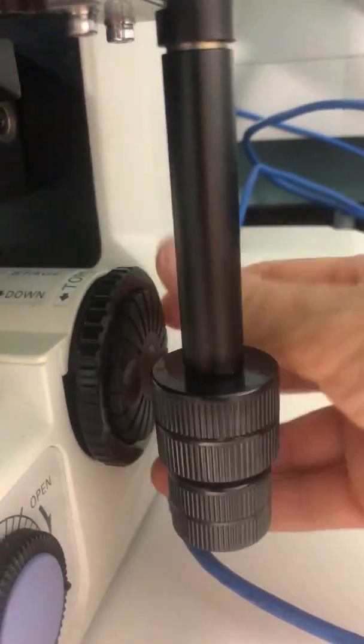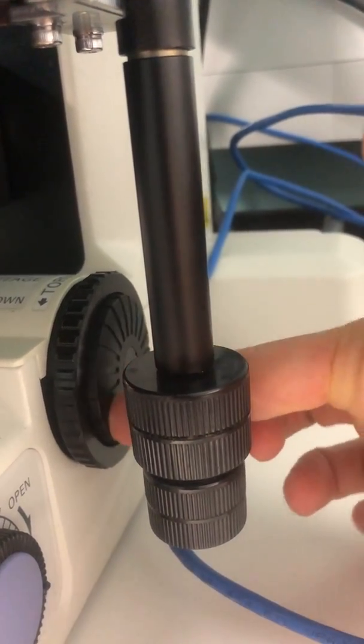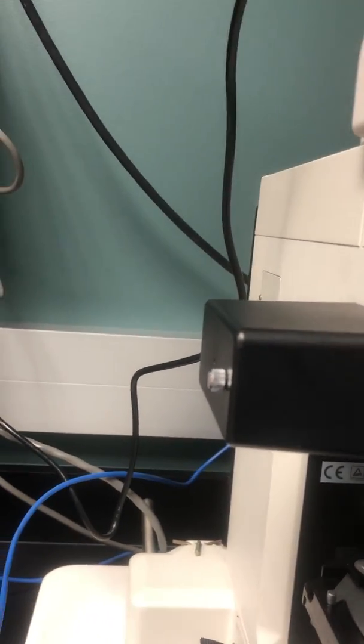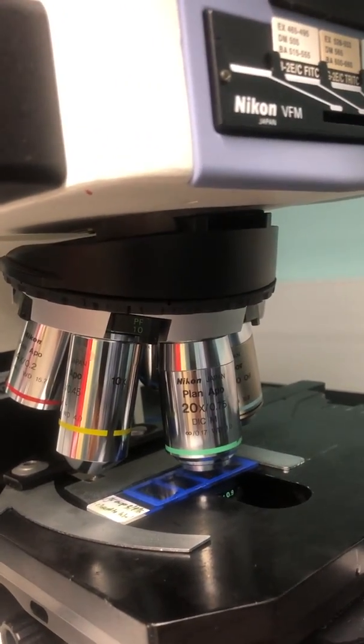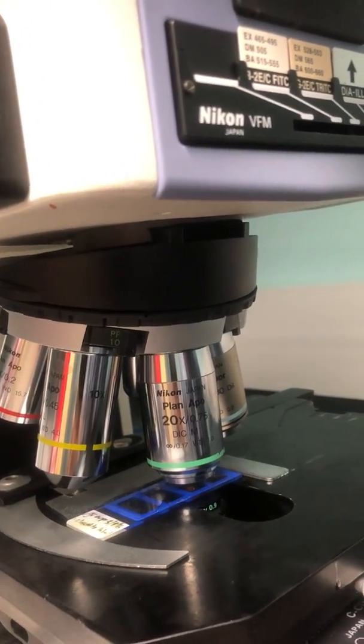So you're going to come in here. You're going to use this focus knob. The big part is the coarse focus, and the small little dial here inside is the fine focus. It's the same thing as this over here, but this seems to be a little bit loose, so this one is working better. And so you're going to find your cells, and you're going to set up the focus for your cells, and you're going to really work with the dial to get good contrast. A big part of that is decreasing the light so that the contrast looks pretty good. All right, and at this point, you are ready to take an image.